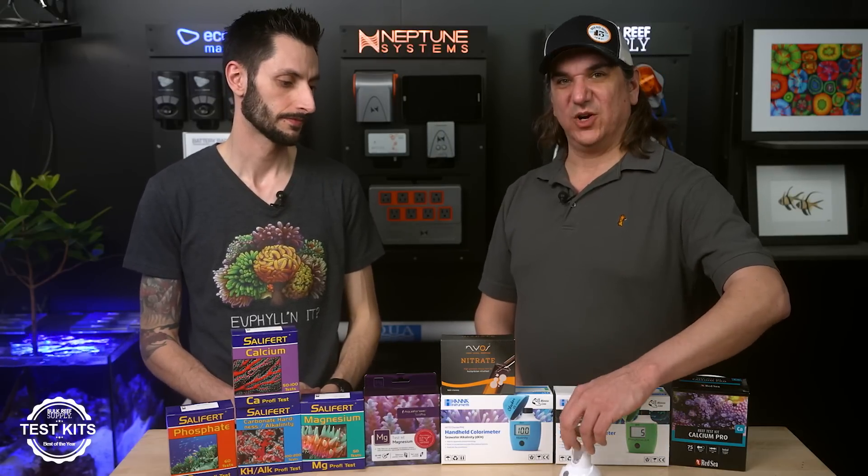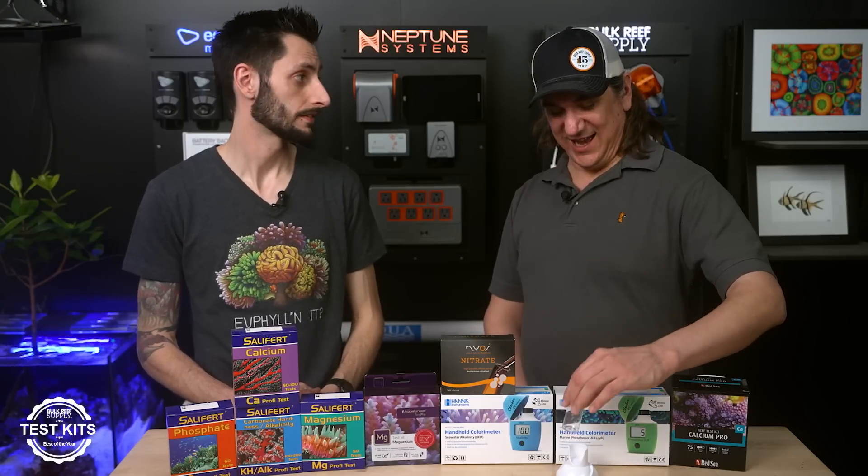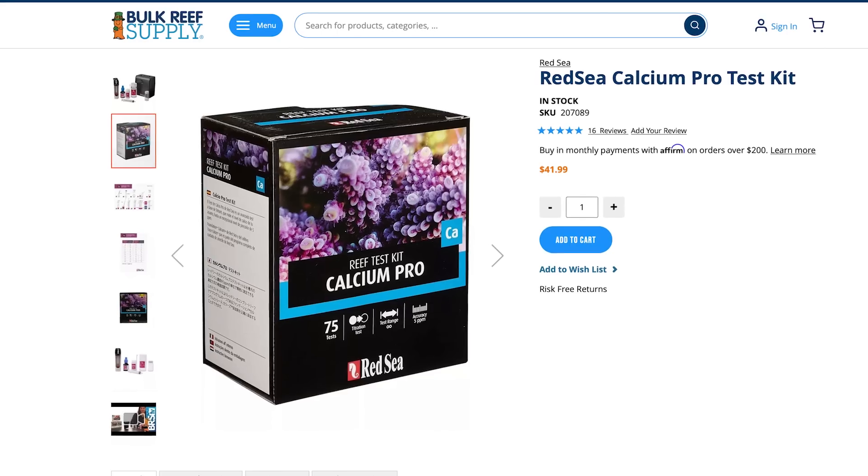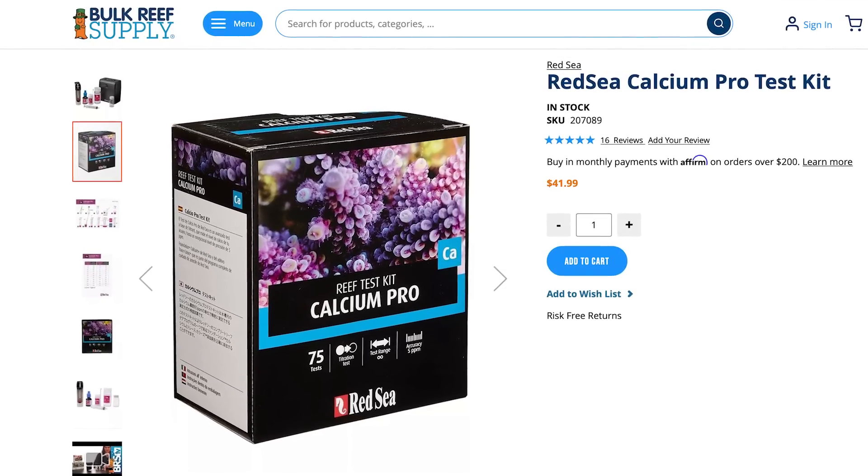For what it's worth, regardless of your test kit — even if you picked up the Salifert ones — you don't have to use their container for titration; you can use the Red Sea cuvette as well. One of the things about consistency that I like, especially when applying it to different skill sets, is that consistency is partially the chemistry but also the ease of the chemistry. These kits say 'shake for one minute, swirl for one minute,' but the reality is it could be 30 seconds or a minute and a half. If regardless of skill set we're all coming up with very similar numbers, the chemistry is forgiving, giving a consistent result without requiring you to do it perfectly every time.